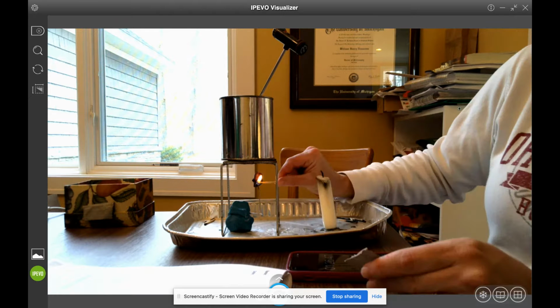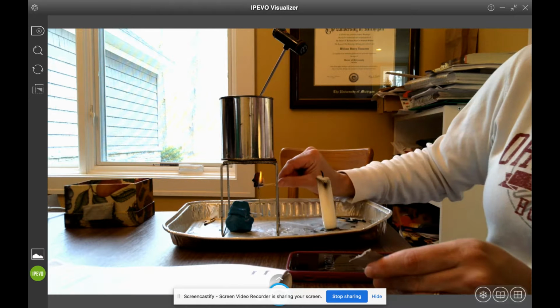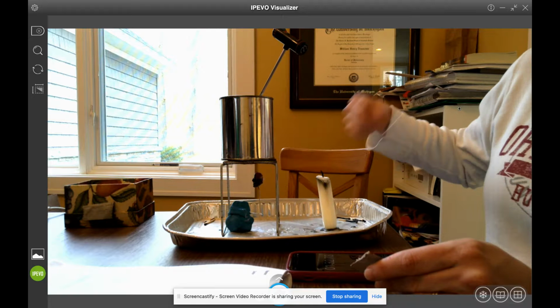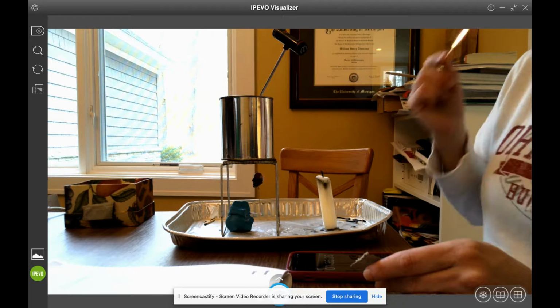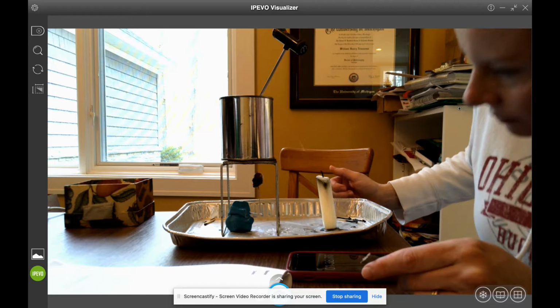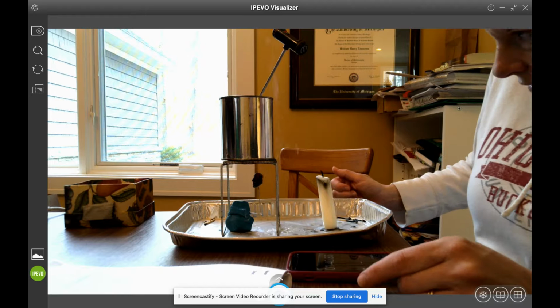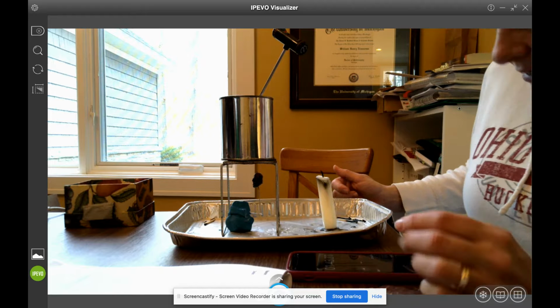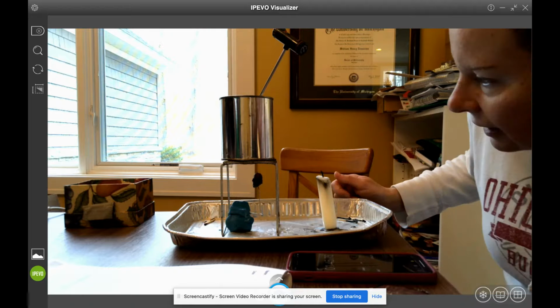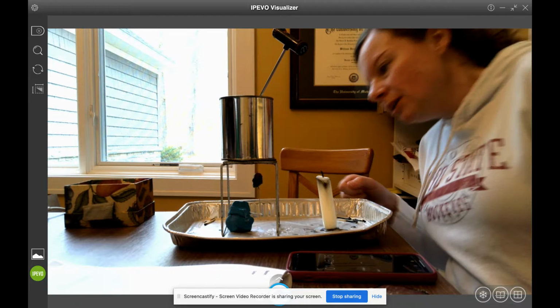Yes, I'd like to get this one more side here to burn. It doesn't burn very well, does it? It gets caught and then it goes. It's on fire. Okay, doesn't smell nice. Let's call that kind of done. And it burned 1 minute, 45 seconds. It's pretty black around the outside.